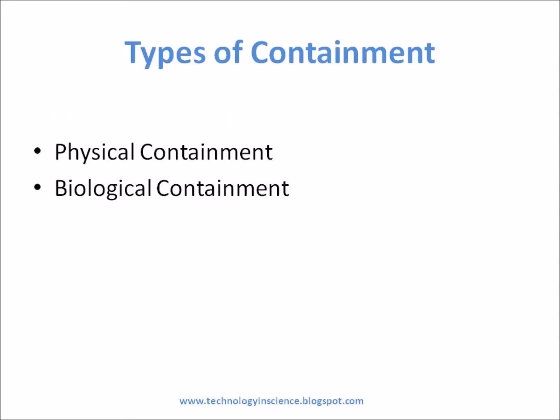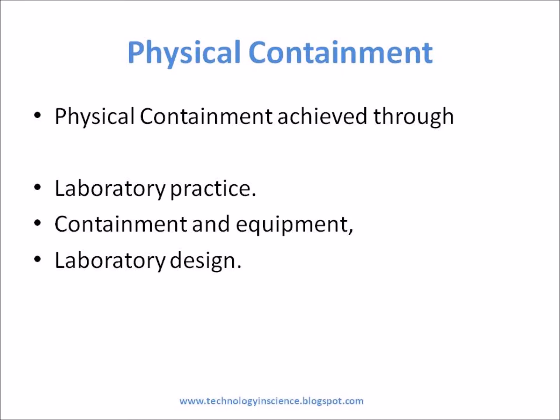Types of Containments: Physical Containment and Biological Containment. The objective of physical containment is to confine recombinant organisms, thereby preventing the exposure of researchers and the environment to harmful agents. Physical containment is achieved through laboratory practice, containment equipment, and laboratory design.